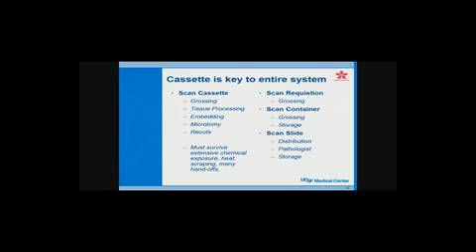and that the print survives everything you're going to throw at it, because these things are going to go through all the tissue processing, they'll go through decal, they're going to be scraped at embedding, they're going to be knocked around. So they really have to survive everything. We did a lot of testing in cassettes. We put them through all the process, start to finish, hundreds of them, and then we would scan at every step to be sure that they were working. And we really have had very few problems with cassettes.